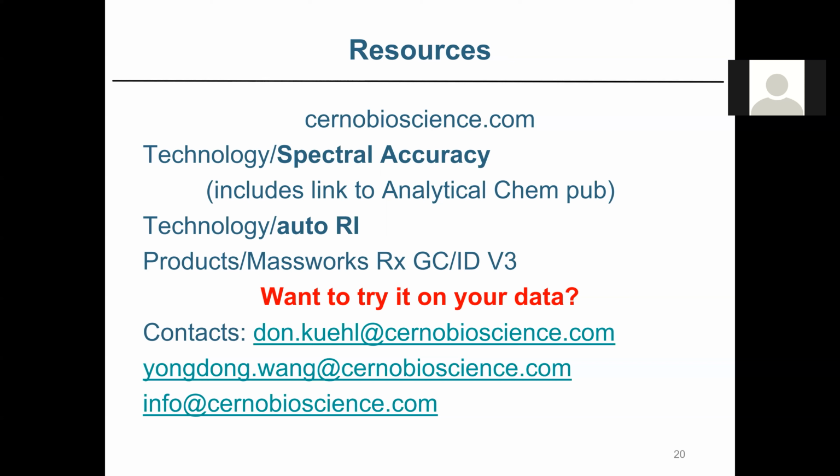We're vendor agnostic. That's one of the things that differentiates us. So we'll work with Agilent. We can work with Shimadzu data. We can work with Thermo data. We can work with PerkinElmer GC data. It doesn't really matter. Thank you, Don.